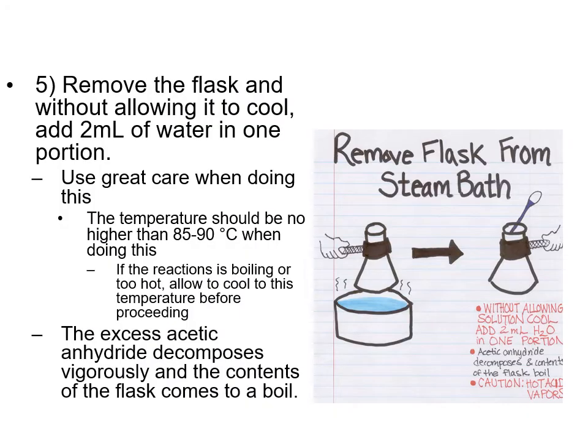So the next step is in order to neutralize any excess anhydride that may have not reacted. You have to be very careful with this step, because the anhydride is extremely reactive with water, right? So it will most definitely probably vigorously bubble. So you have to be careful with that.